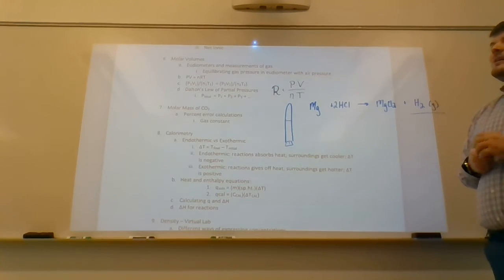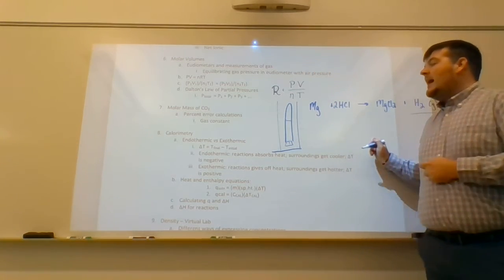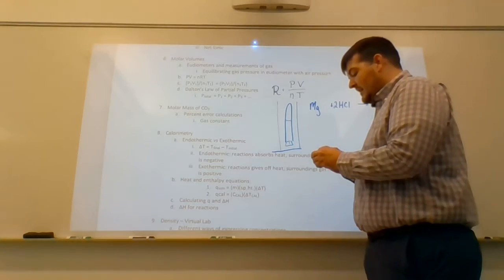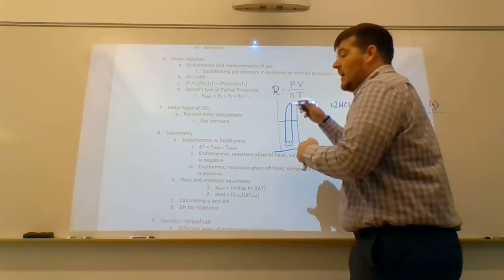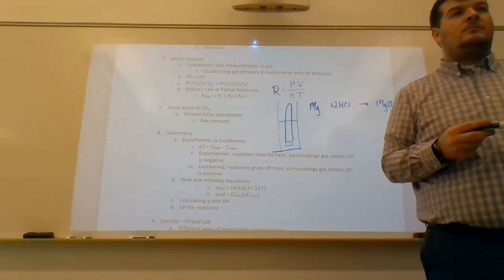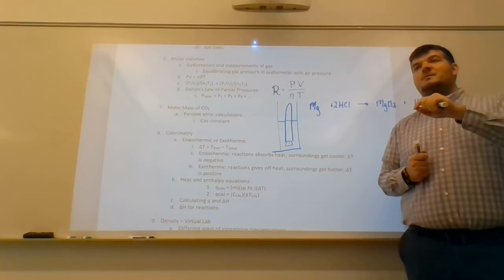Now, after you did this part, you put this whole apparatus into a big graduated cylinder. What was important about the level of the water in the graduated cylinder? It should be the same. In this case, we would have to move the eudiometer up and down until the water levels matched. Why did we have to do that? That's right, because we read the pressure on the barometer, and the pressure on the barometer was based upon the room pressure.